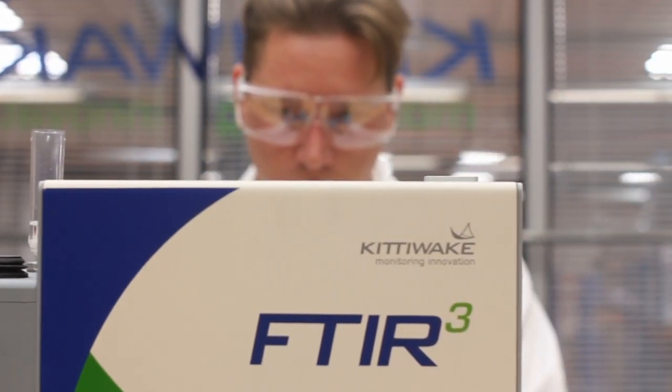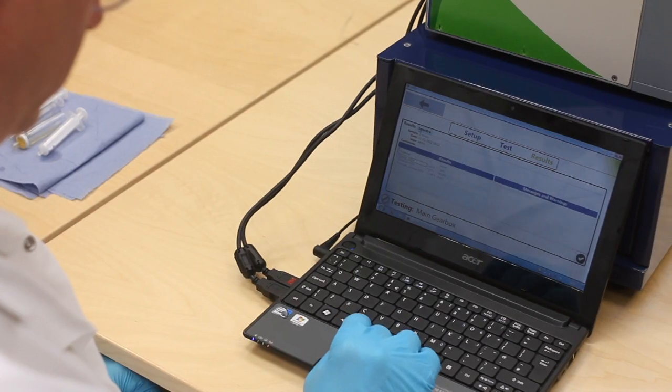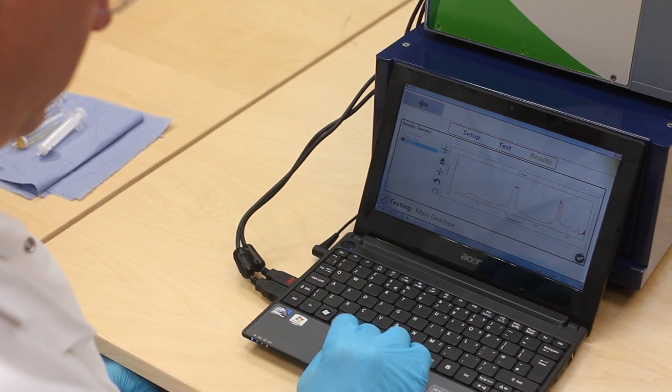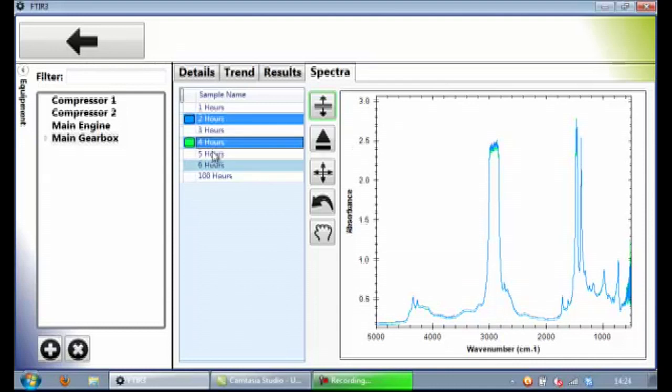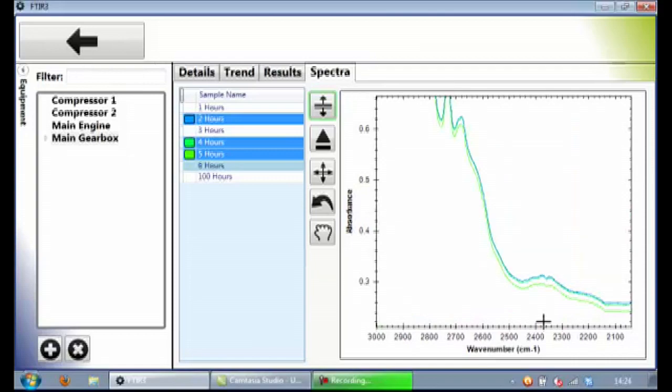Waste fluids are fed from the rear of the unit for safe disposal. The oil analysis is then displayed on the netbook. Both spectral information and ASTM compliant oil parameters can be viewed as required.